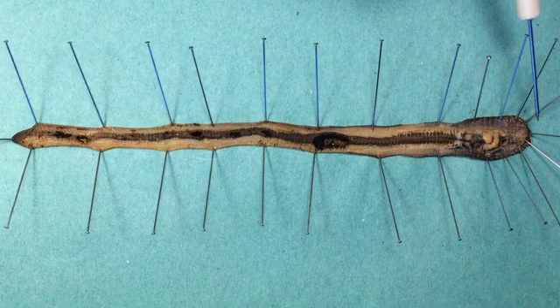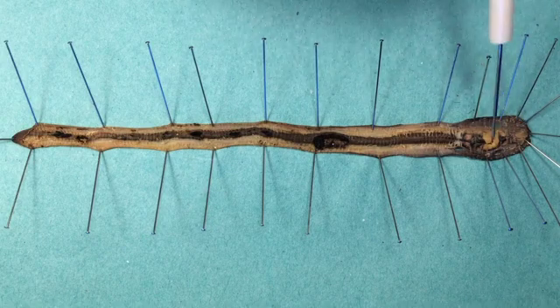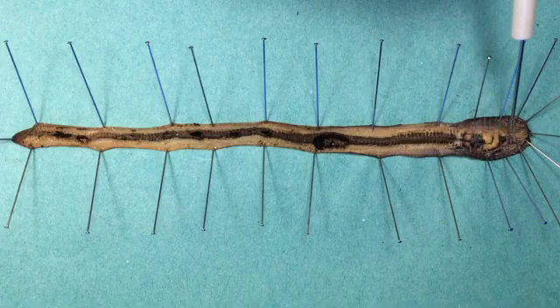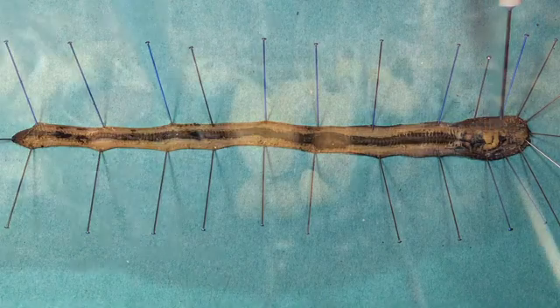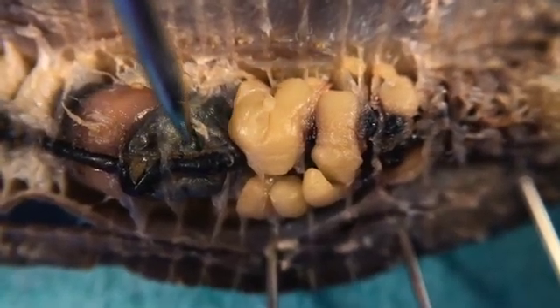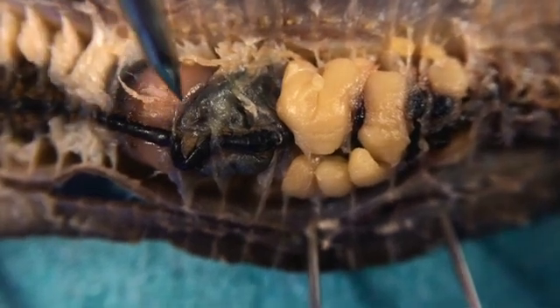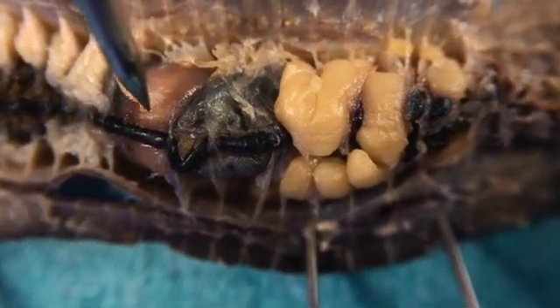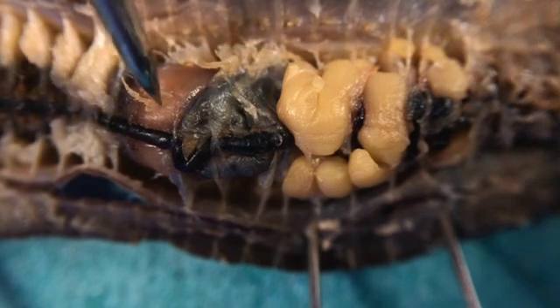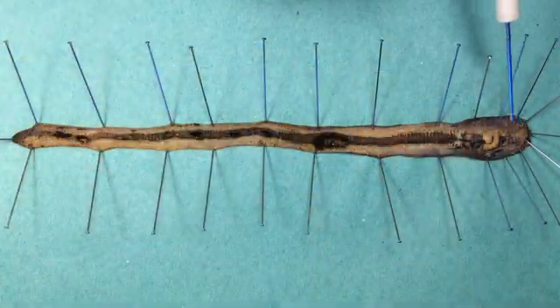At the most anterior end of the worm we'll have the mouth, the pharynx — all of which is quite muscular and draws food into the oesophagus. That's all hidden behind these structures here, which we'll come to in a bit. Then the food moves along to the crop, which is a sac-like chamber that feels quite soft and extensible. Then we have the gizzard, where food is mixed and ground up — it's quite thick-walled and actually quite hard. All of that is the foregut.